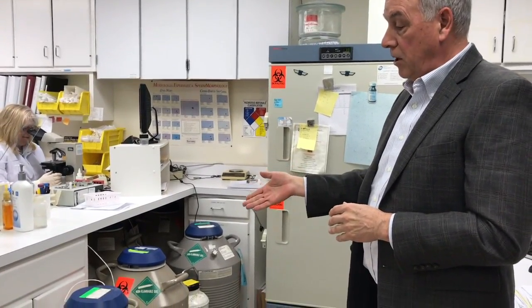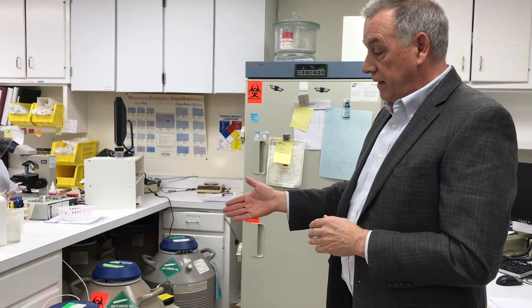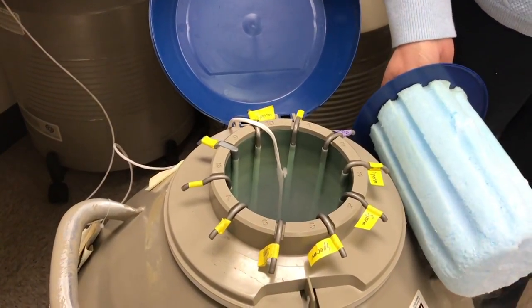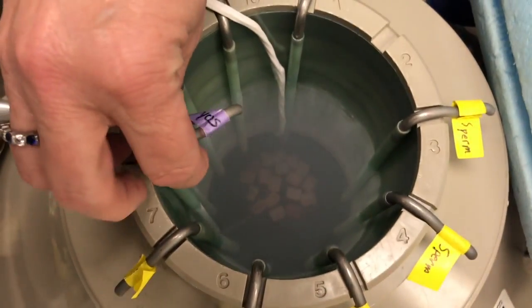The reason we use the smaller liquid nitrogen tanks — they hold 35 liters of liquid nitrogen — is that we think they are more robust in maintaining their temperatures than the large bulk tanks. They have a much longer holding time, a static holding time, which means with the lid closed and the tank full, they'll last over a hundred days maintaining their negative 196 degree temperature.